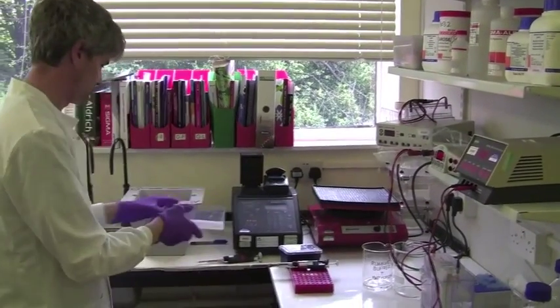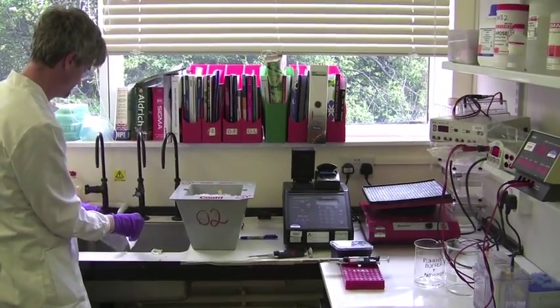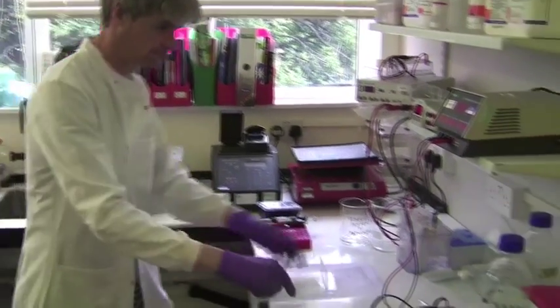It is important to wash the membrane between each step to remove unbound reagents and therefore to increase the signal-to-noise ratio.